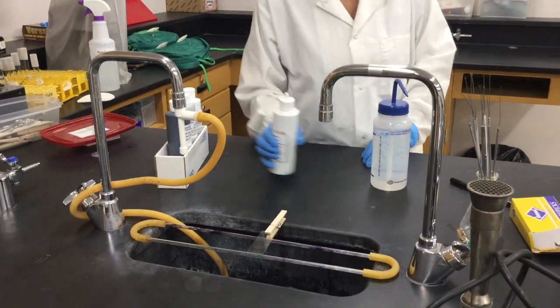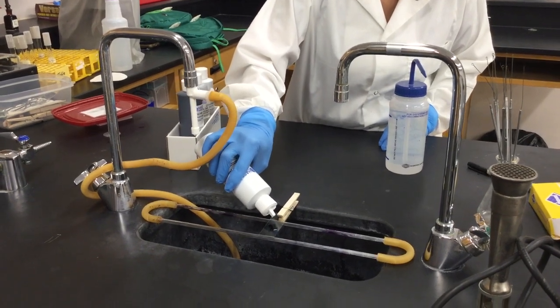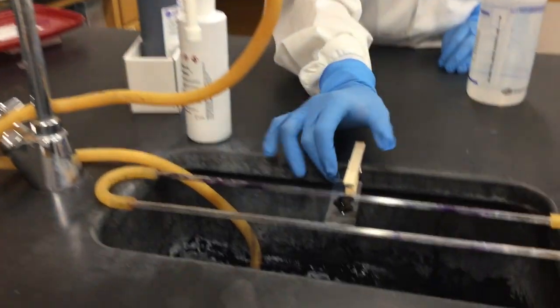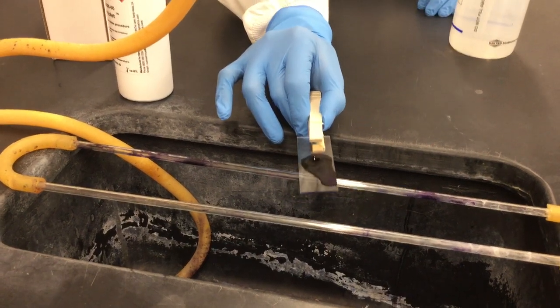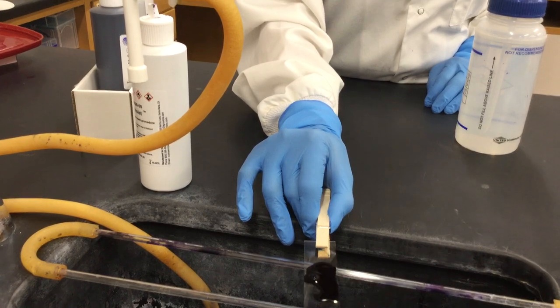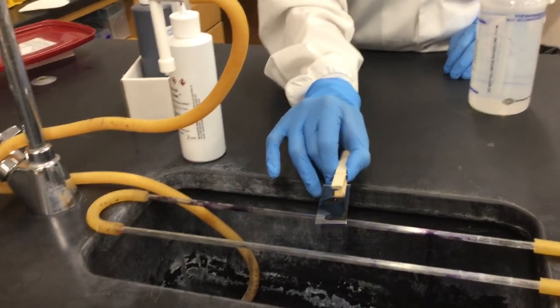So it's for 1 minute. Crystal violet, you try to cover the entire area where you have your smear. And then you don't need to over add dye into there. Whatever dye you have, you just move the slide around until you see that it's covering everything.